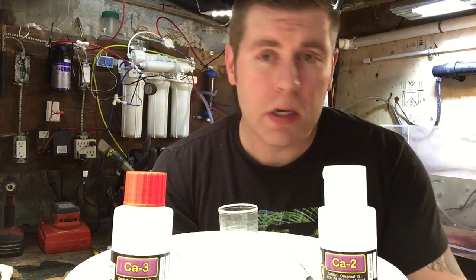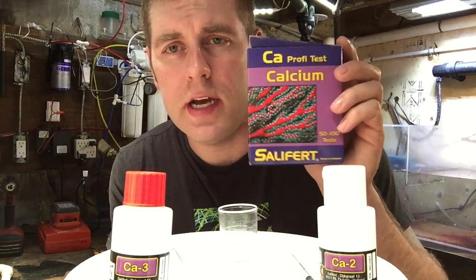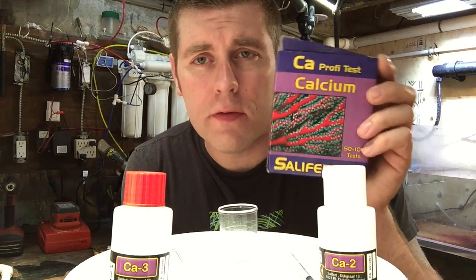Hey YouTubers, Farm Boy Reef here, FBR. Today I'm gonna show you how to test for calcium in your reef tank using the Salifert test. It's a really good test. You need your calcium to be 425-450 parts per million in your reef tank so your corals can absorb the calcium to grow and get better coral growth.